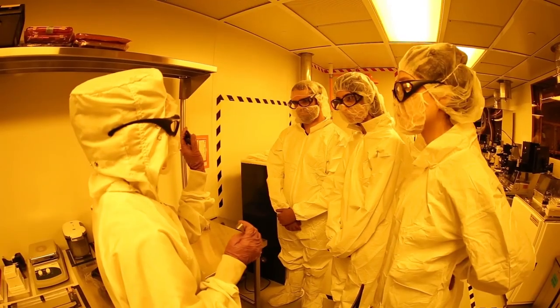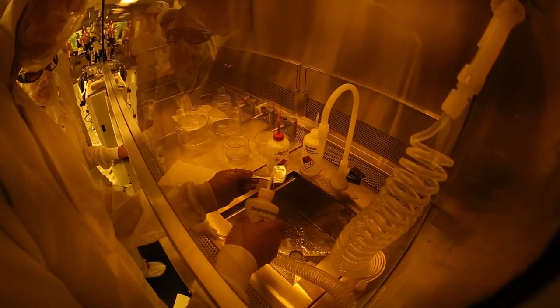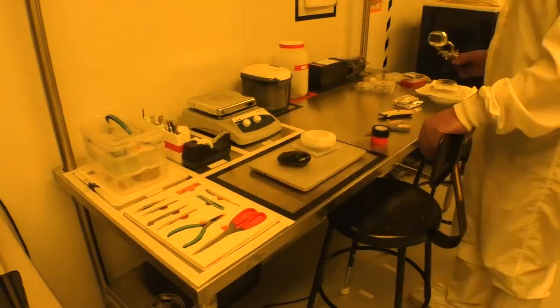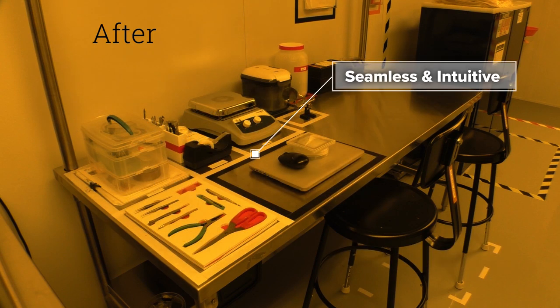This is very important. But also, it enables a better teaching and research experience for the students, so it enhances student experience, and also it can potentially lend itself to an environment where the research results are easily duplicated. Although 5S is simple, the impact to our lab's productivity is enormous. So my message is that, as a junior faculty, I would certainly encourage and recommend upcoming junior faculty to consider applying this organizational methodology into their research laboratory structure and office space.